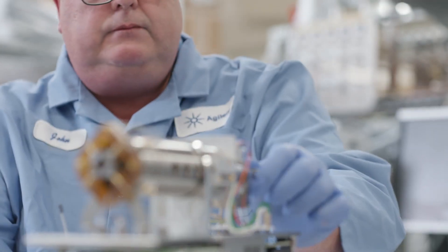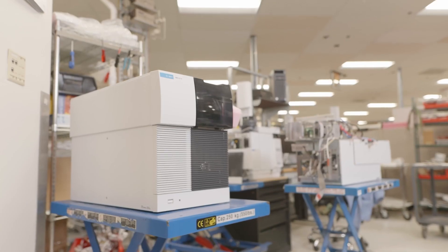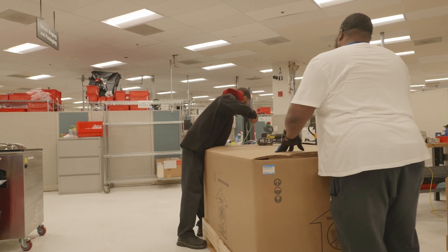Our instruments meet very high standards. When it leaves our plant, we meet or exceed that of a new instrument.